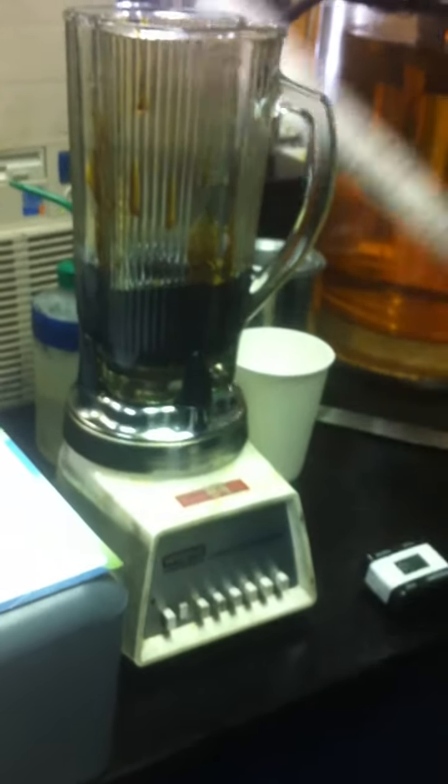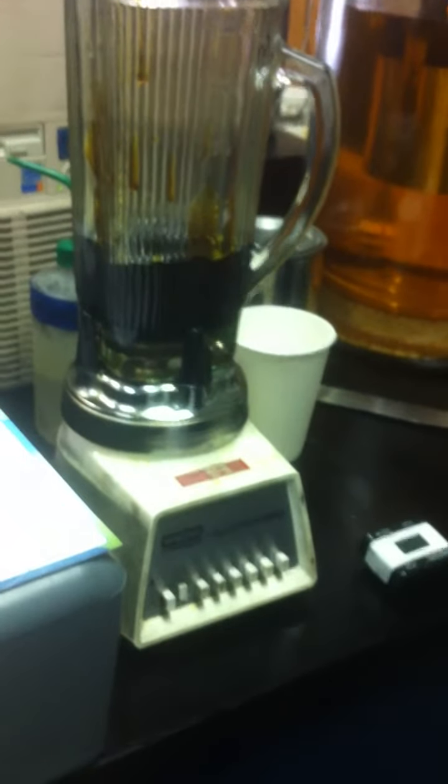And then check the gas. I don't want people thinking that this is a domestic — it's actually a commercial lab blender. It's a lot like a regular one you use at home, of course.